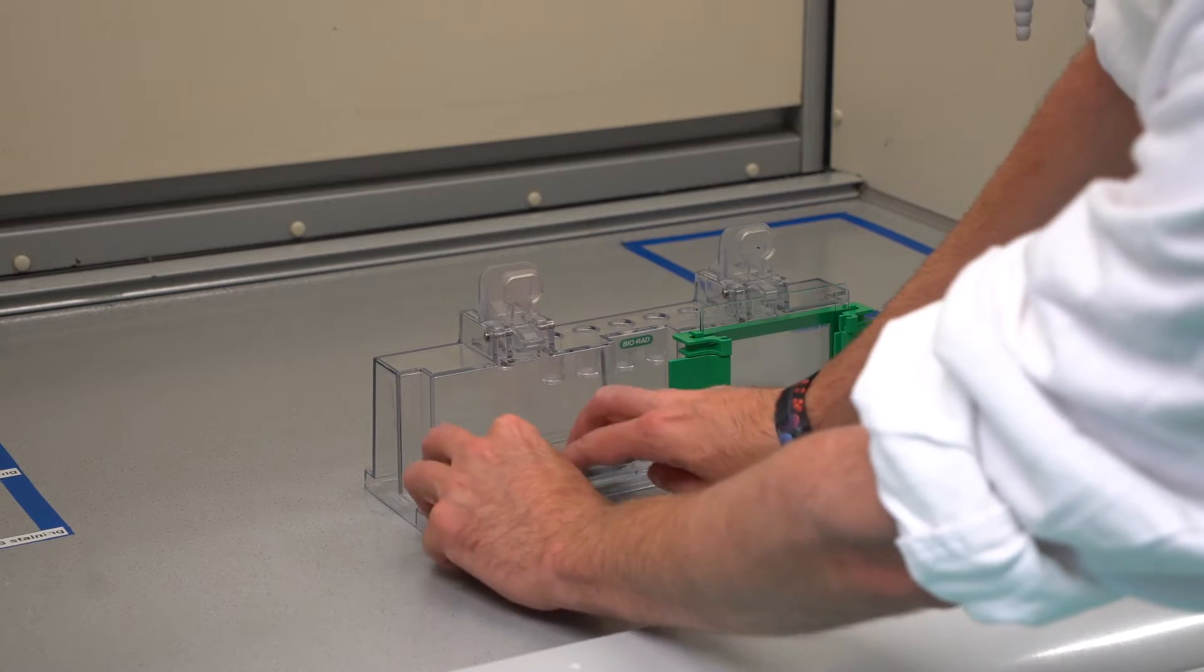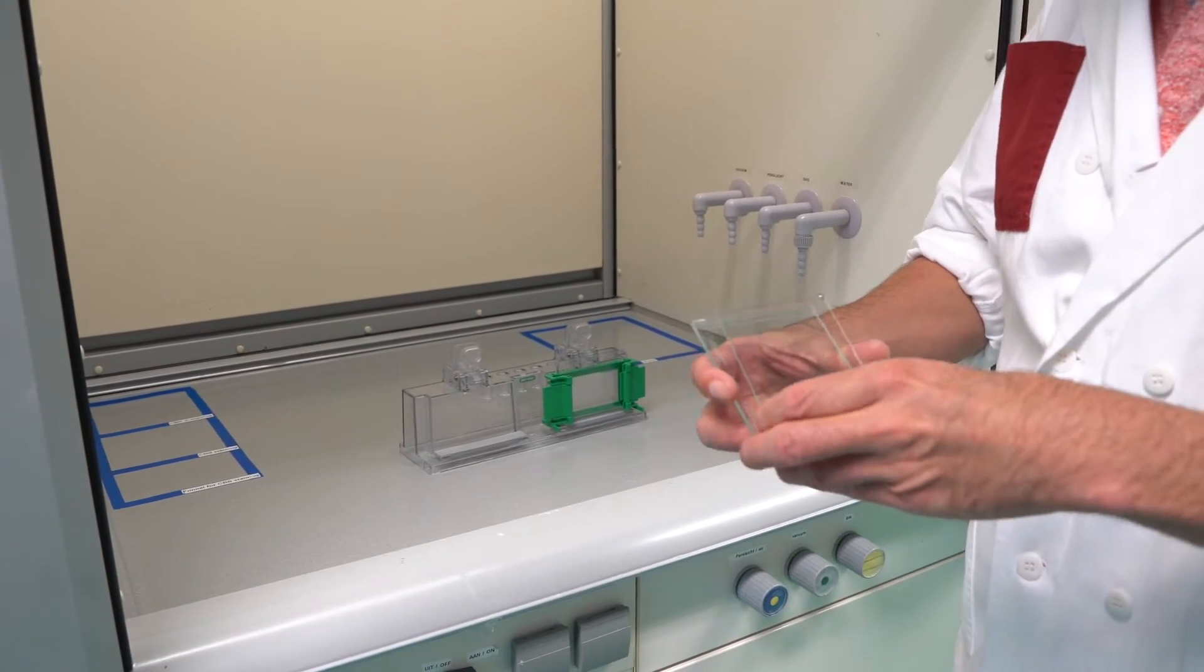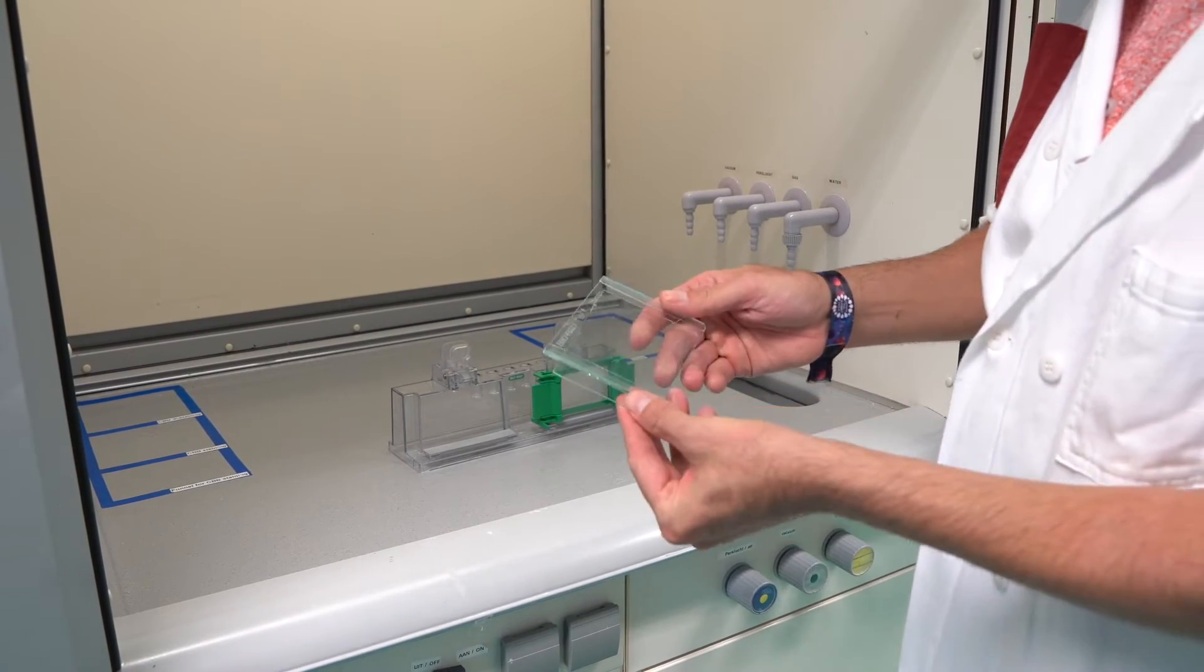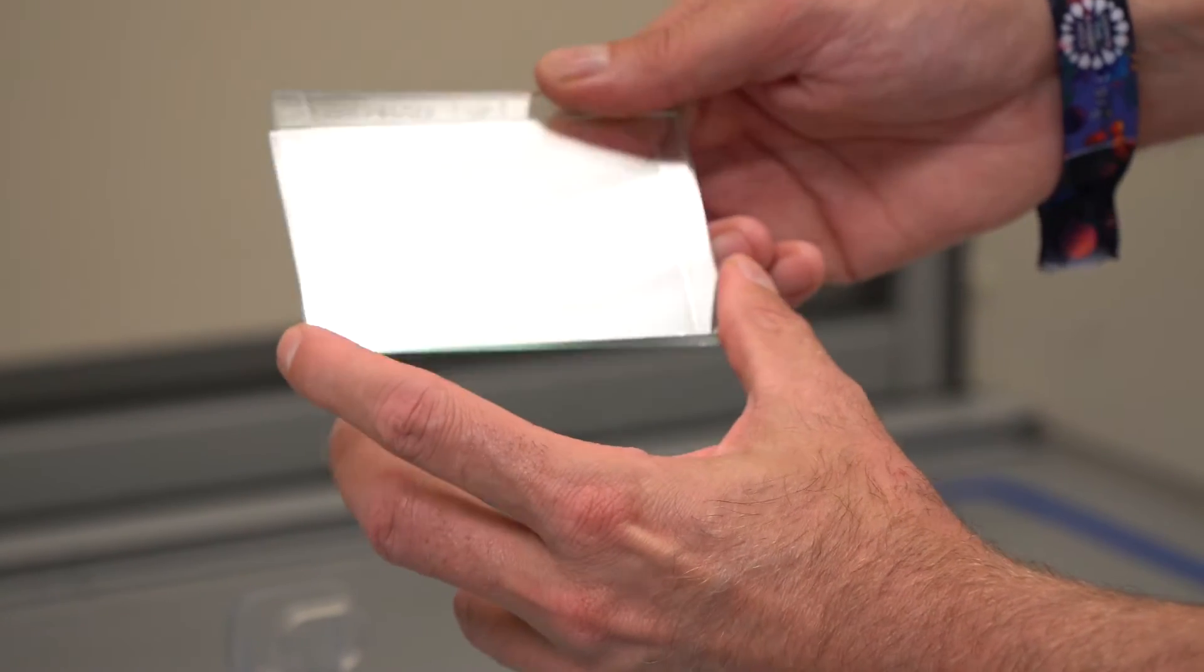Place the rubber on the casting stand. Two glass plates are required for pouring a gel: one spacer and a short plate. The spacer plate is thicker and has two elevations on the sides, the spacers.